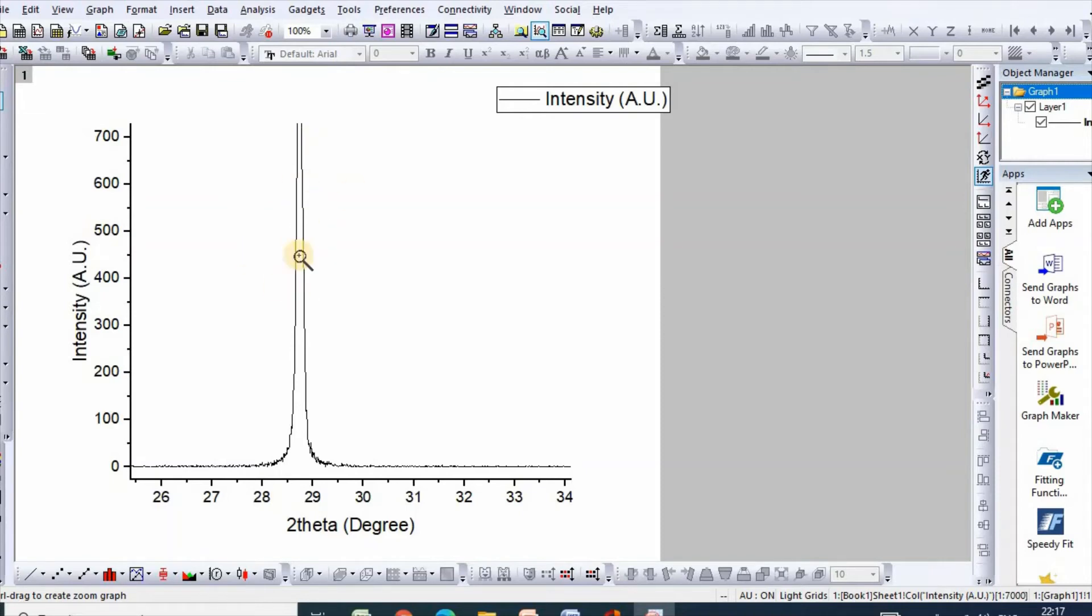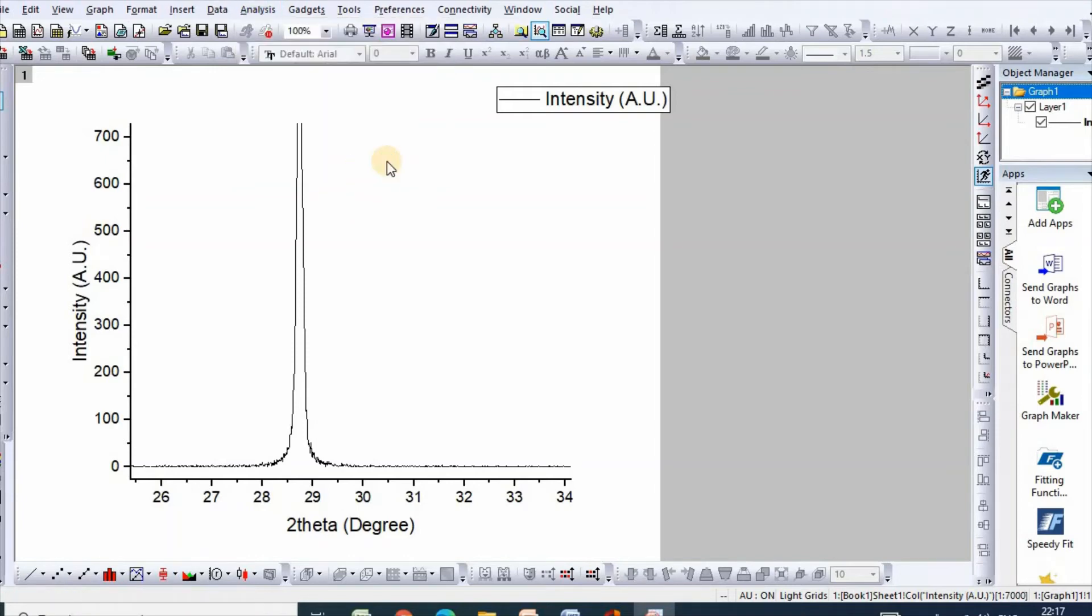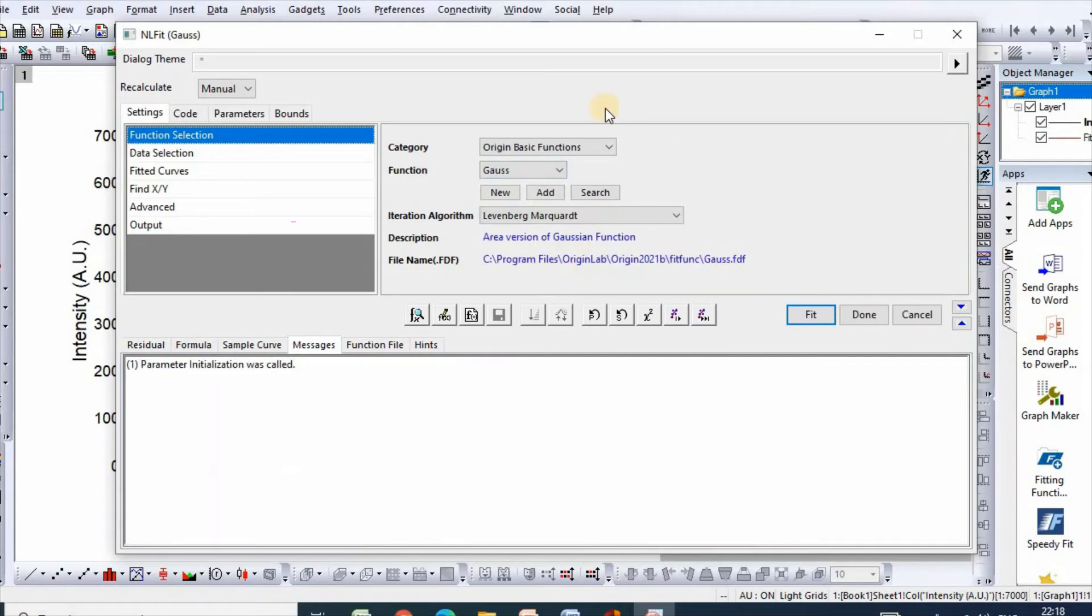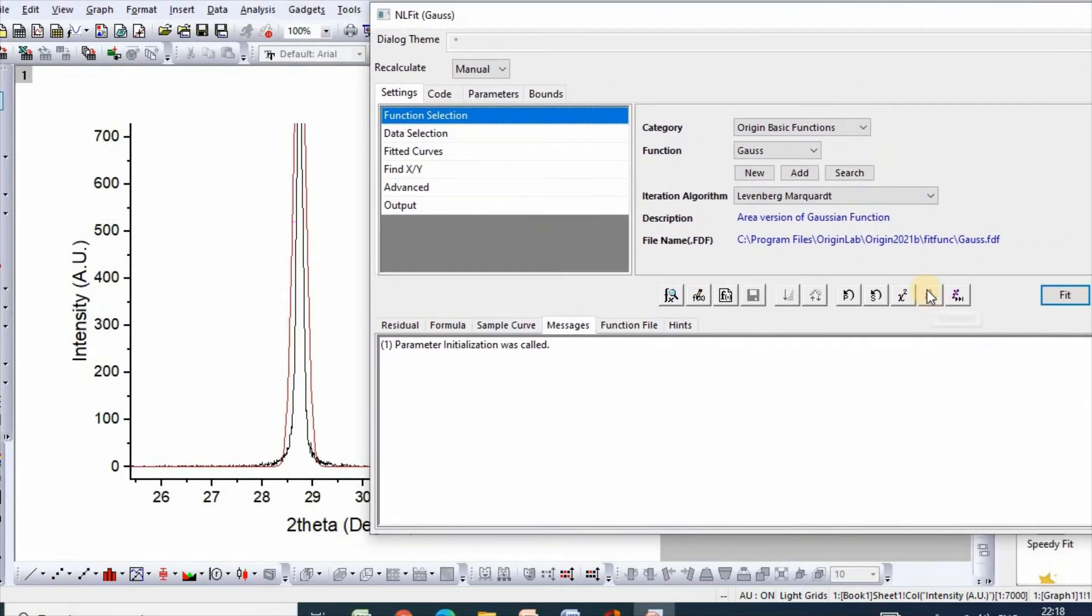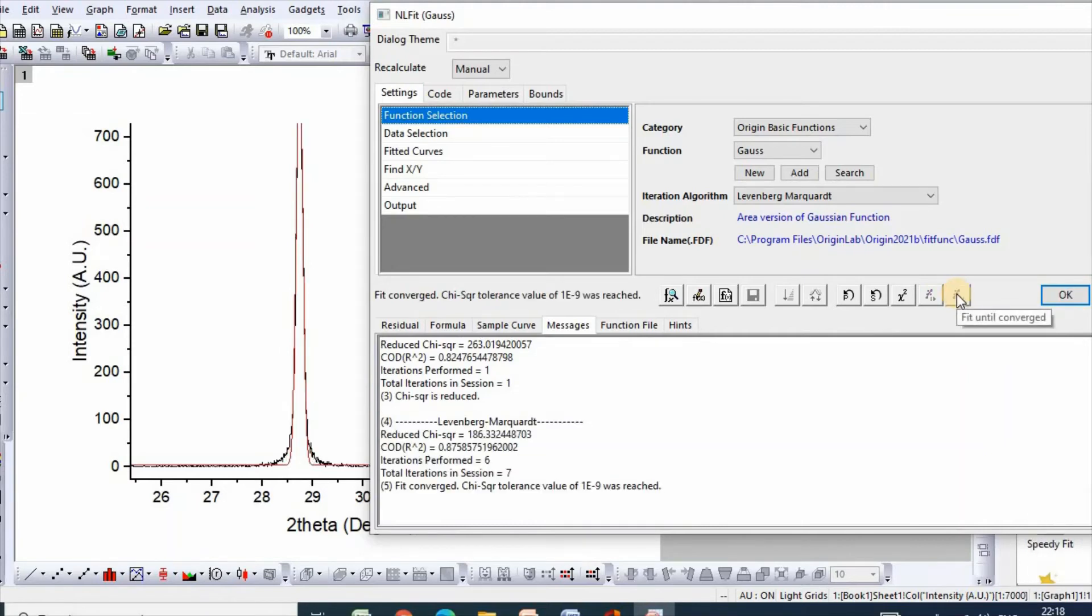Here is my magnified most intense peak. Now let us click Analysis. Then go to non-linear curve fit default. You need to select this Gaussian web function. Then click here and fit until conversed. After this finally click OK.